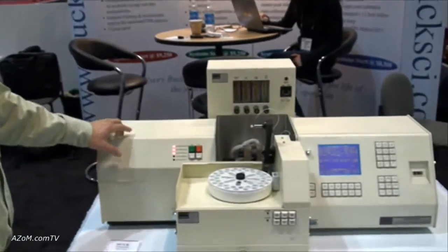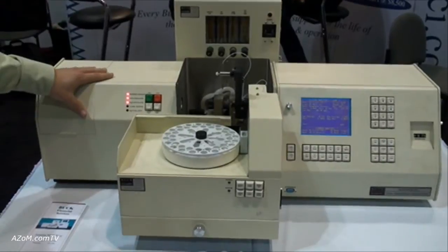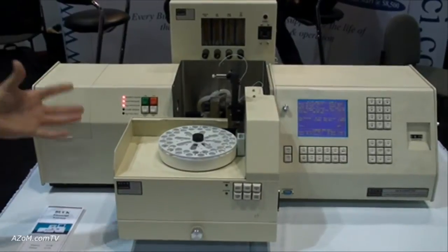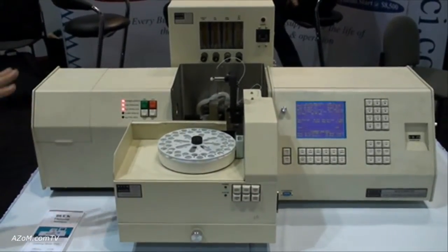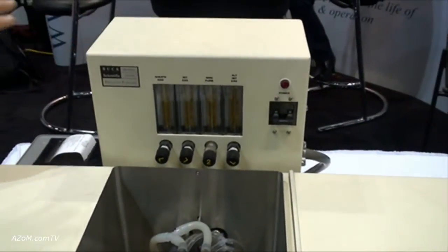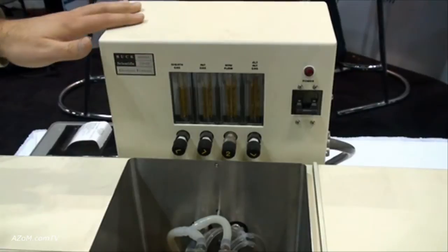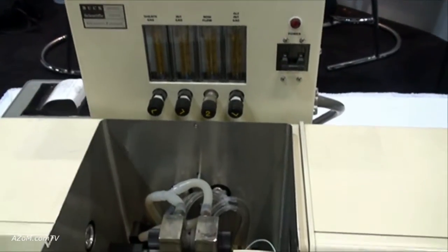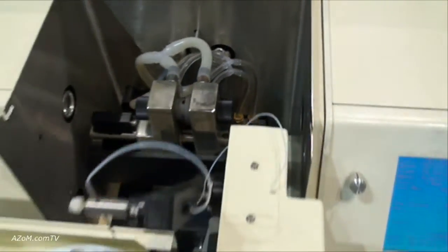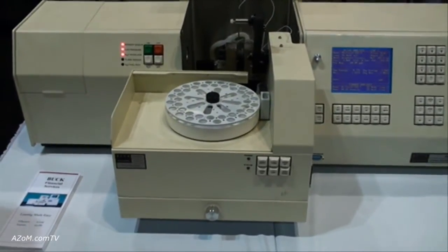This is the graphite furnace setup for the Atomic Absorption Spectrophotometer, set up on our 211 Accusys system which has automatic flame ignition. Right now it's configured for graphite furnace work. The graphite furnace module can be added to any of our 210 or 211 AA systems. Inside here is the graphite furnace head with a graphite tube, and over here is the graphite furnace autosampler with a 40-sample carousel.